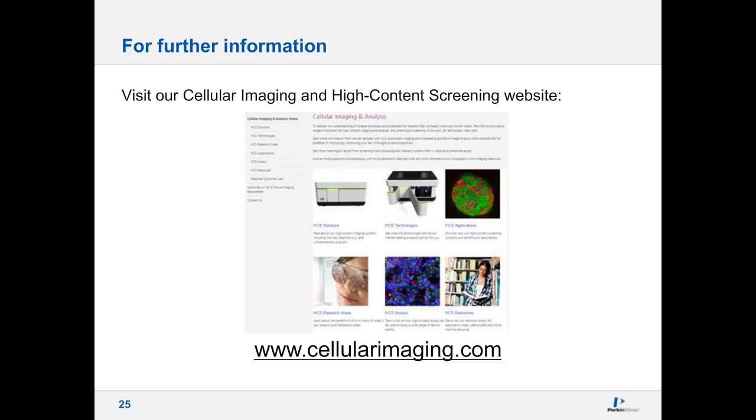While I'm at it, I might as well continue. We have a very broad range of parameters that we can read off samples using our Harmony software. Very powerful, specifically for phenotypic classification, are advanced parameters such as texture and what we call STAR morphology, because they have been specifically designed to answer this type of question.